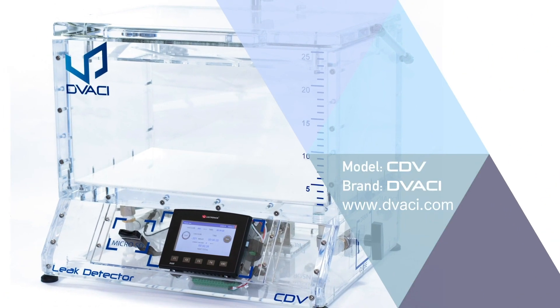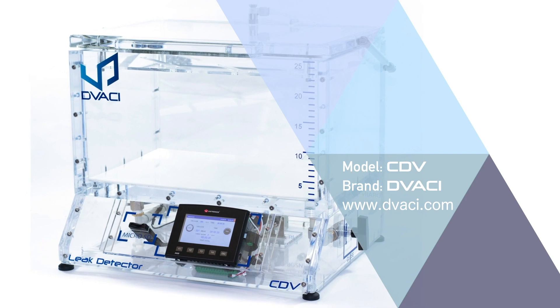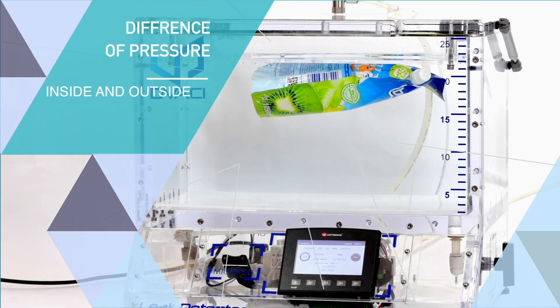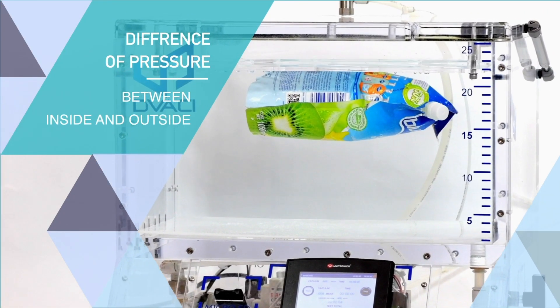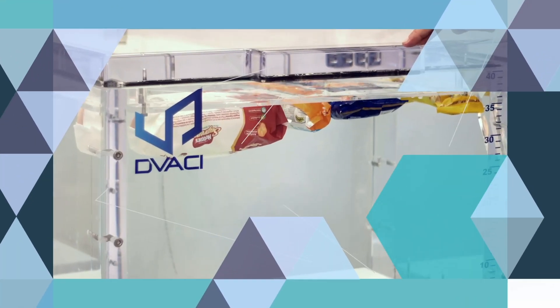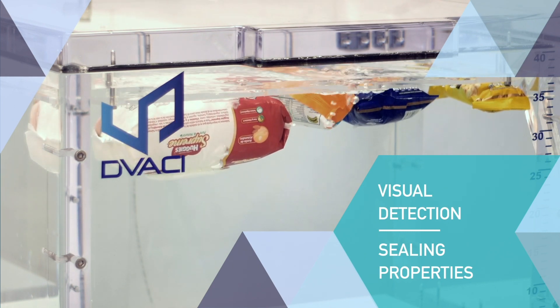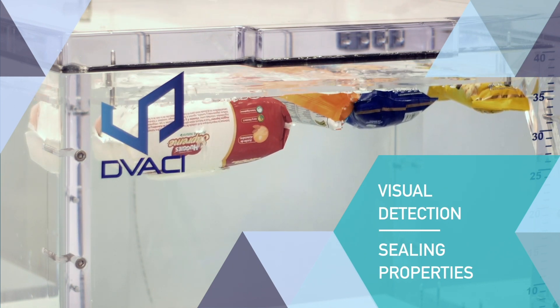CDV is a package leak detector based on vacuum effects and visual detection. It will create a difference of pressure between the inside and the outside of the specimen. By observing the leakage behavior, the user can easily determine the sealing properties of the packaging.